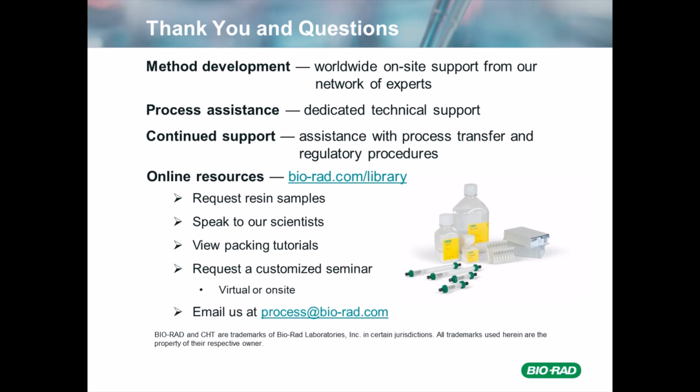So if you're doing a gradient elution, of course, then plates per meter matter to some extent. But I've never seen anyone, frankly, do a study that says, well, it turns out that we tried 2,000 plates per meter and that wasn't enough. We tried 3,000 and that wasn't enough. But we went to 3,500, that was enough, and so that's our lower limit. So pretty much just keep a record of what you use in process development and try to be as generous as possible on the manufacturing floor, because the people on the floor have a lot to do, and the wider the ranges, the happier they are.